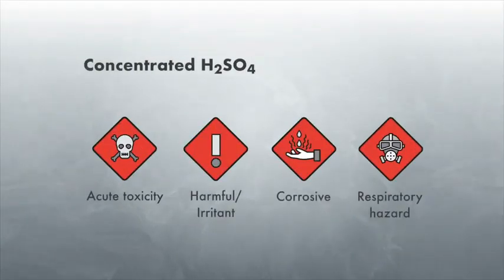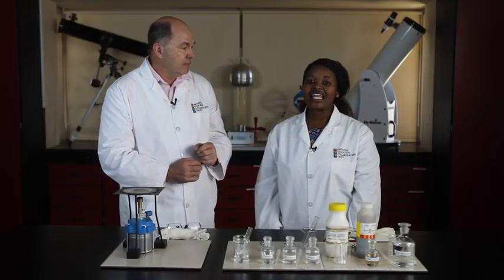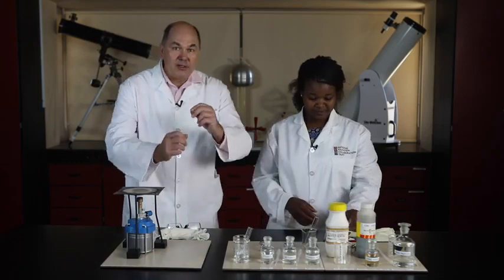Concentrated sulfuric acid is a powerful dehydrating agent and it's corrosive. It can cause severe chemical burns if it comes in contact with your skin. We will wear gloves and safety goggles. Let's put those on now. Okay.